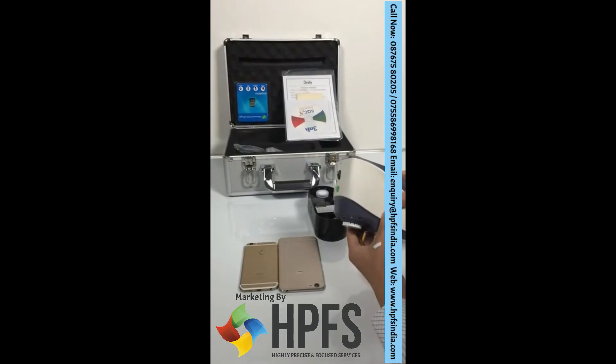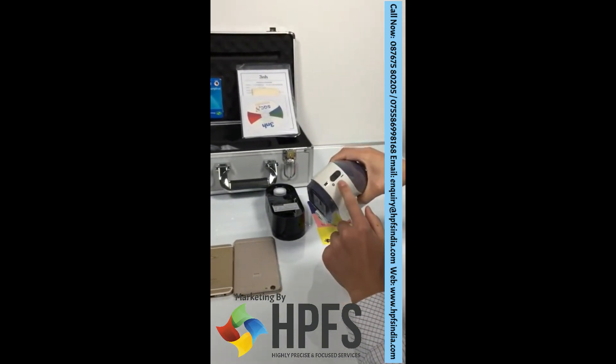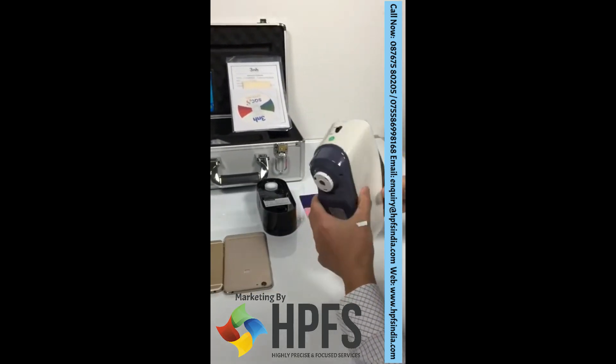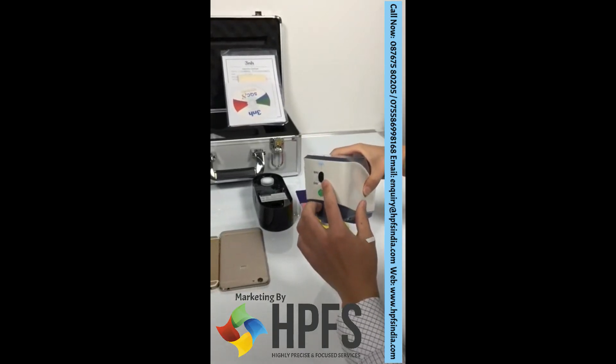This is the model YS3060. Power switch, measuring button, measuring aperture, aperture switch.